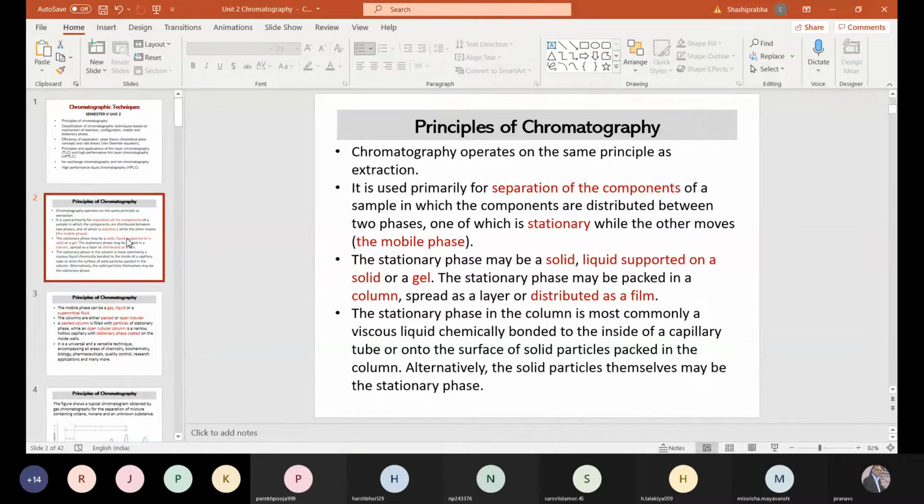And there are certain guiding principles of chromatography which one should know to understand what actually one can achieve, one can do with several chromatographic techniques which are available now. The whole story started around 75 years back. But the basic guiding principle in chromatography is that in such separations, there are two phases. One is a stationary phase and the other phase which moves. If both the phases start to move, it will not be considered or termed as a chromatographic technique.